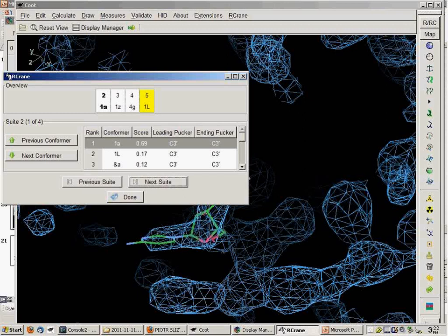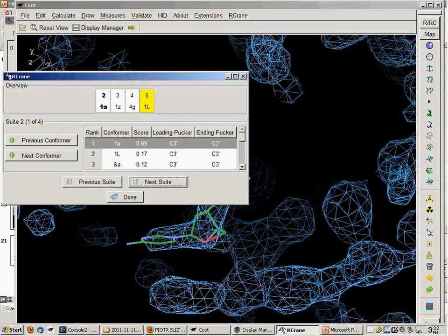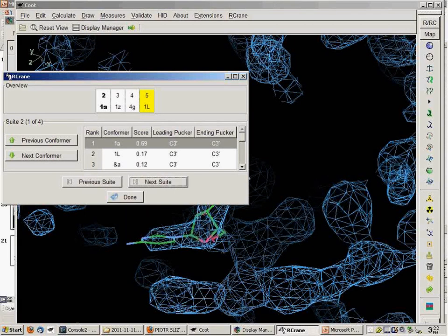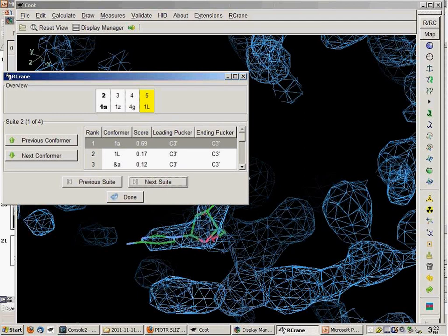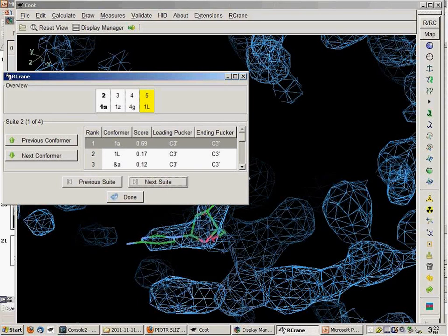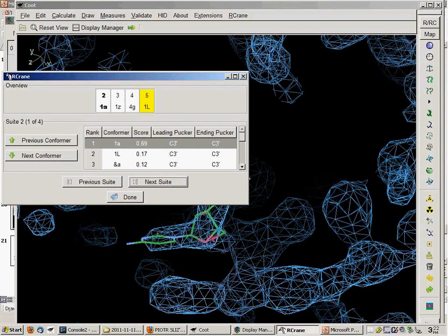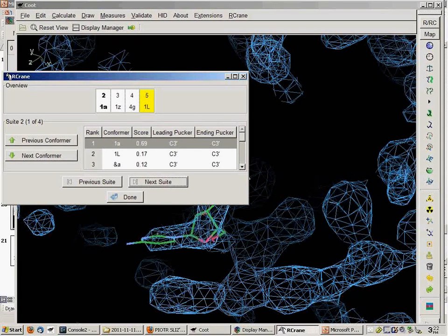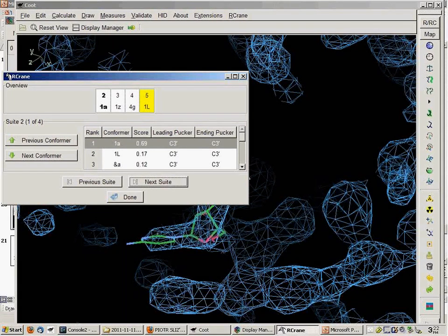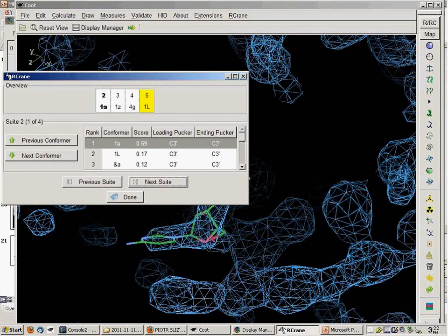And imposing the torsions from the predicted conformers is the main difference over just doing a standard Coot real space refinement. I'm imposing fairly light torsion constraints, and also very, very strict restraints to try to keep the sugar pucker appropriate. So I'm building in either a standard C3' or standard C2' endo sugar pucker, and ensuring that those don't get flattened or distorted during the minimization. The sugar ring torsions are very, very tightly constrained.